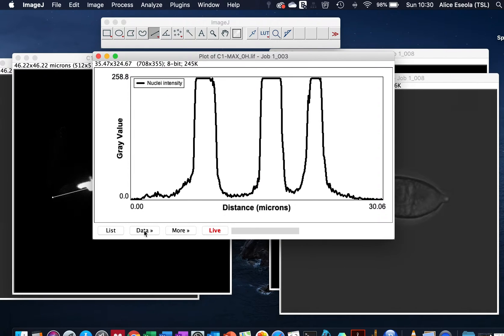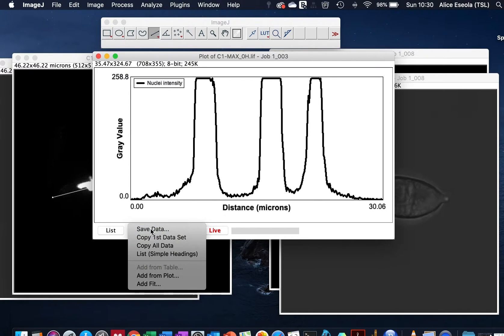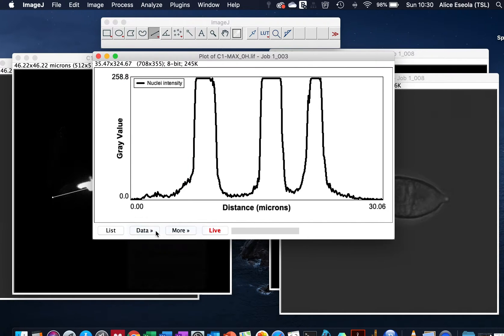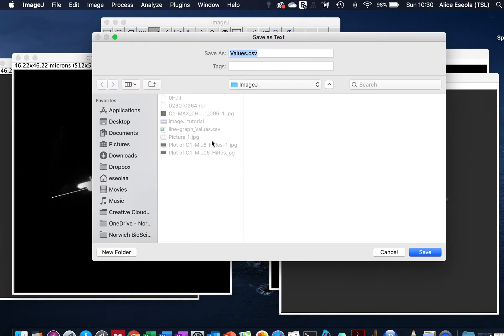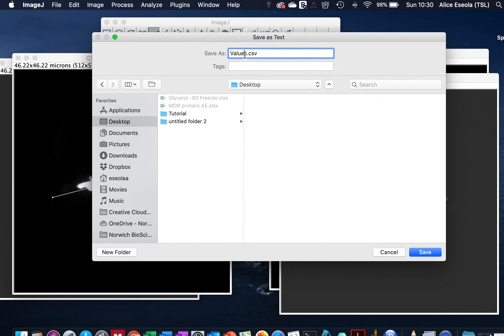And export the values of these plots to Excel file so that we could have a copy that we can work with later. Go to Data, Save Data. We can save this on the desktop and call it line plots.